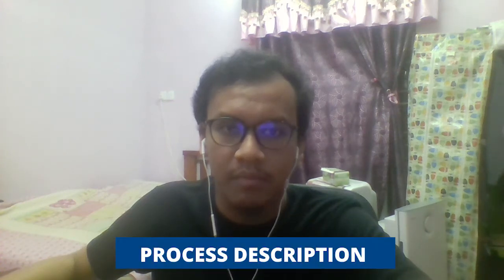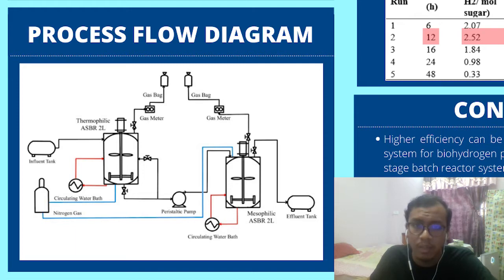Hello, my name is Muhammad Afiq bin Muhammad Asri. Now I am going to talk about the process flow diagram and process description. The process flow diagram for biohydrogen dark fermentation can be divided into two stages of anaerobic sequencing batch reactor, or ASBR, which are the thermophilic and mesophilic stages. A few extra pieces of equipment like a circulating water bath, peristaltic pump, tank and gas meter are used to provide the optimum condition for the reaction to occur so we can get the maximum production of biohydrogen.